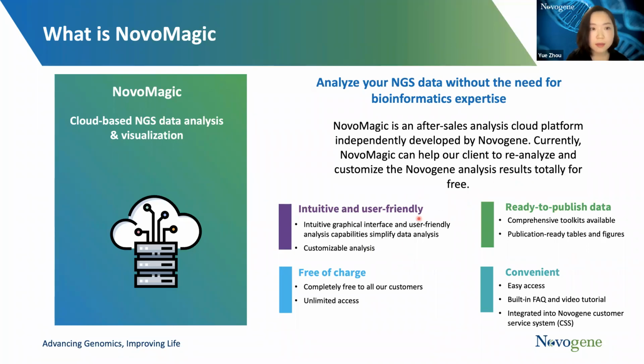Here are some of the advantages of the platform, including the user-friendly interface and ready-to-publish data. It's also free of charge for our clients. You also get unlimited access and it's convenient to use.